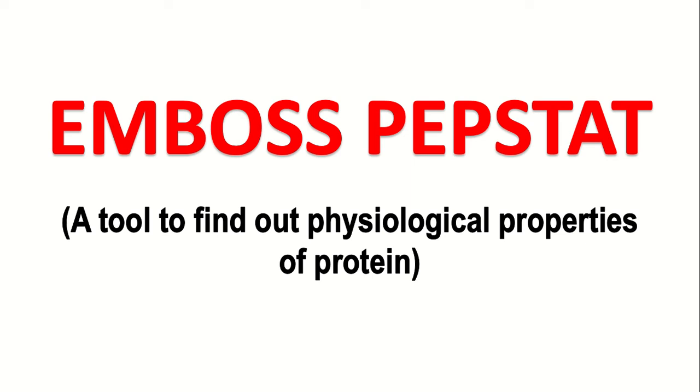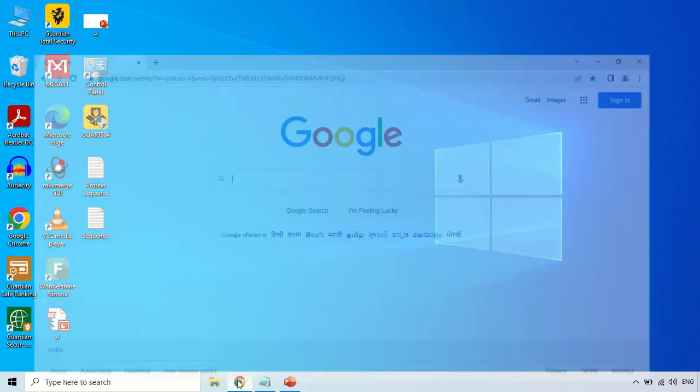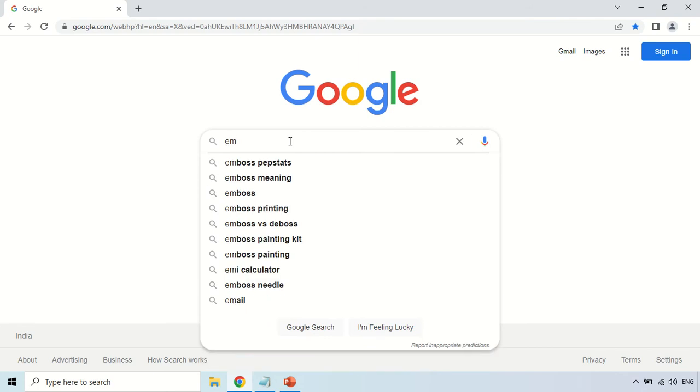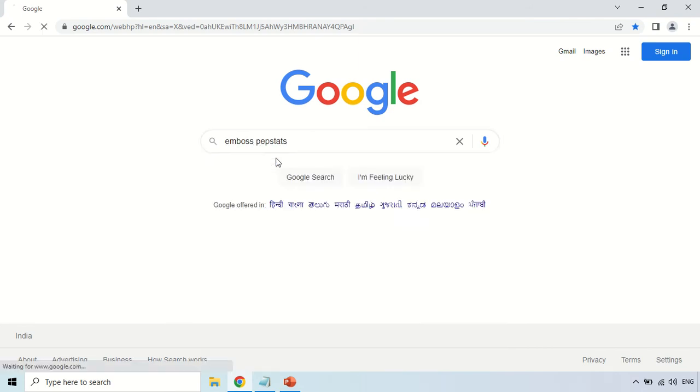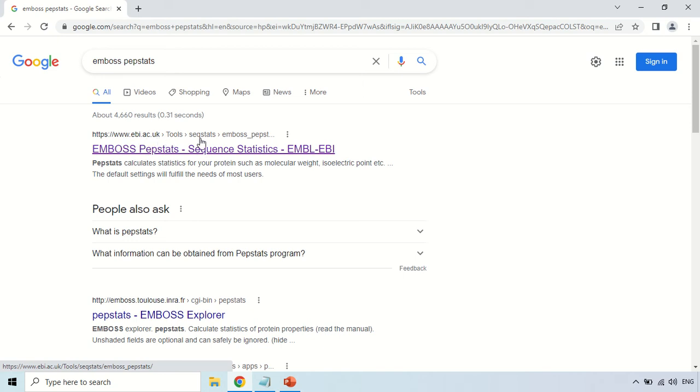How you can use this tool and how you can interpret or understand the results will be clear in this video. To access EMBOSS PEPSTAT, just open your browser and search for this tool. This is the first website, ebi.ac.uk tools EMBOSS PEPSTAT, so just click here.